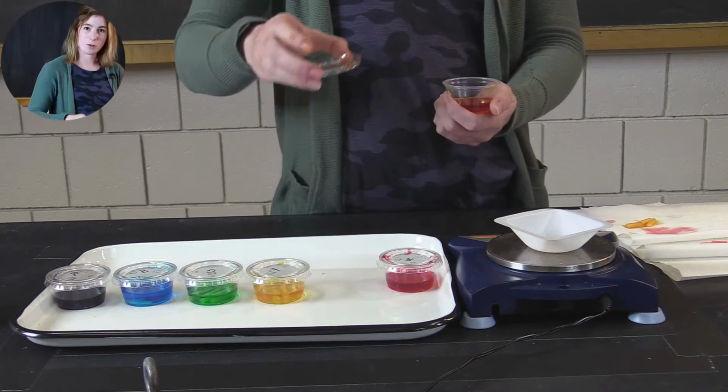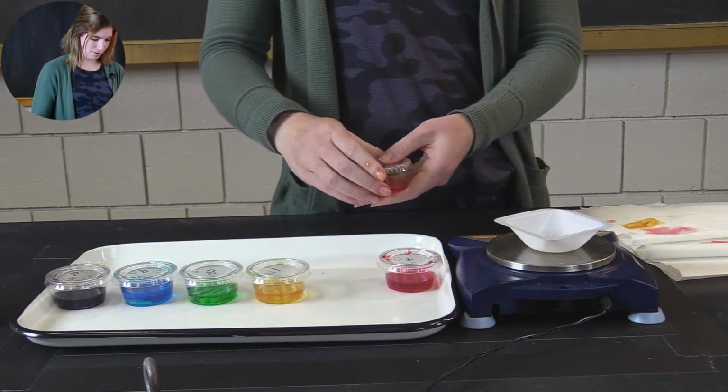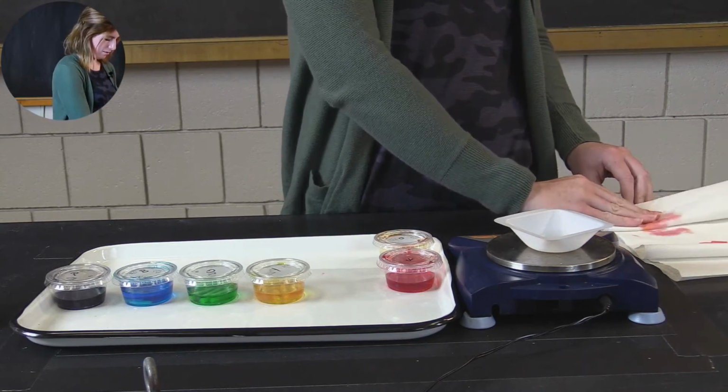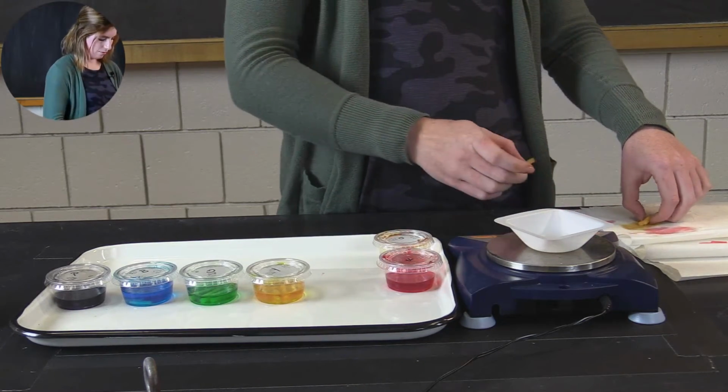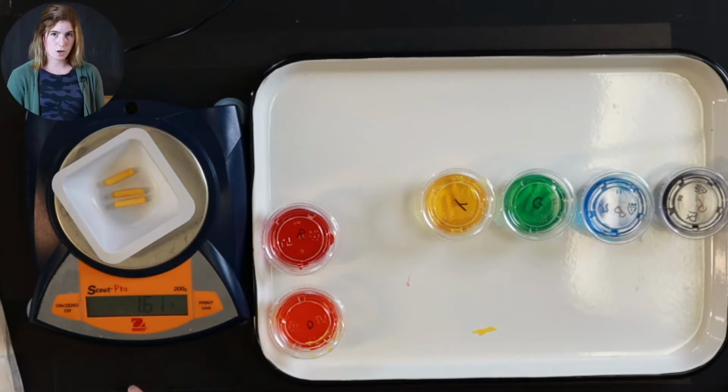I'm going to have some beautiful rainbow colored hands at the end of this. All right, my orange potato final mass is 1.61 grams.